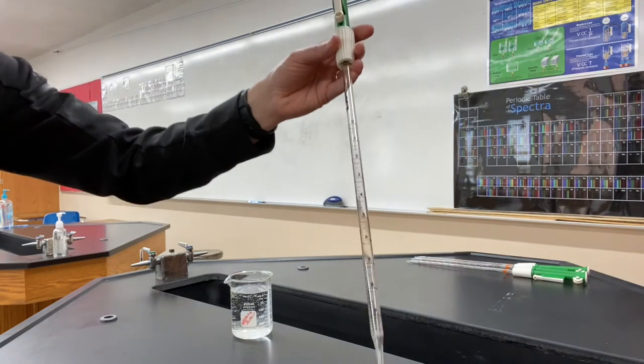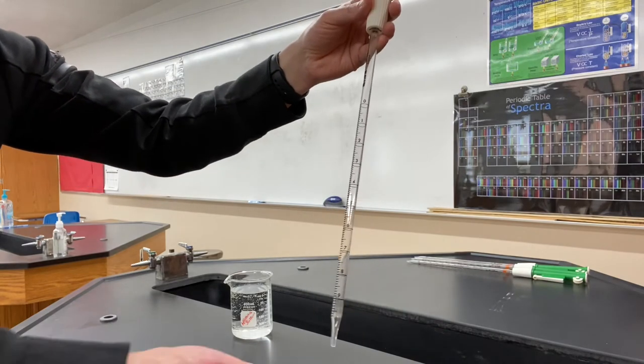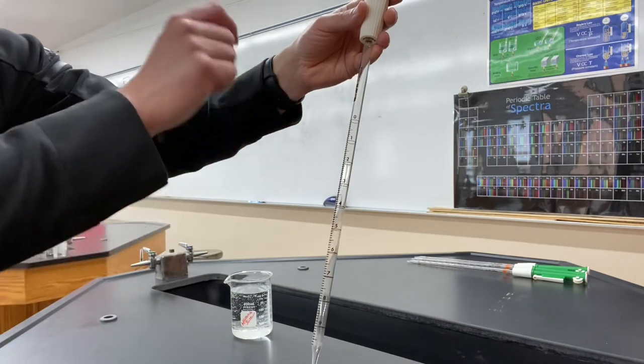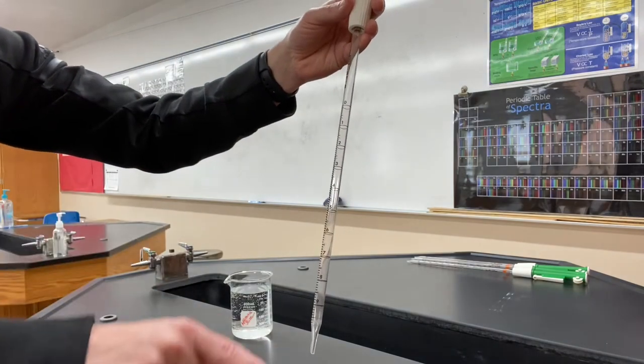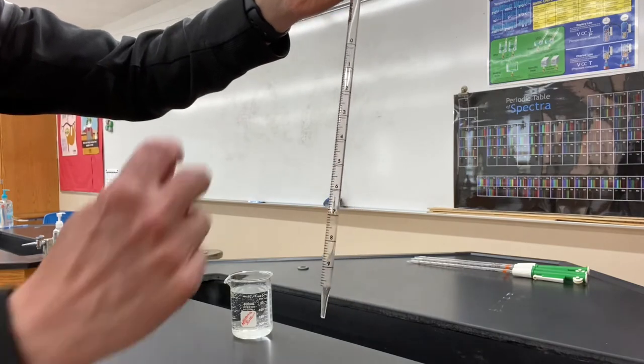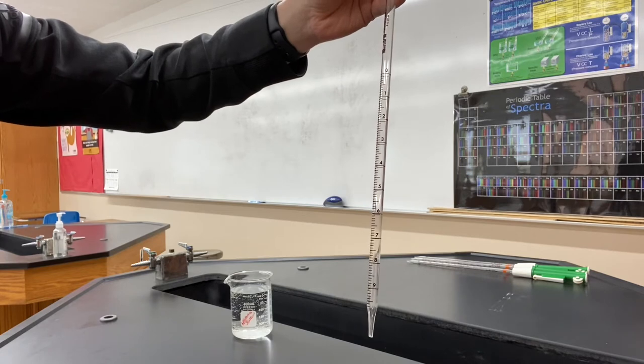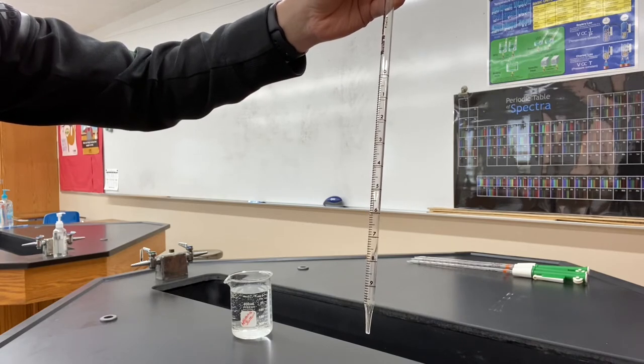We're actually going to use this to get a 25 milliliter sample. So what we would need to do is fill it up to 10, 2 times, deliver the liquid each time, and then go to 5. And whenever we make our measurements, we're going to see that there's a meniscus, a curve in the fluid, and we want to measure from the bottom of that meniscus.